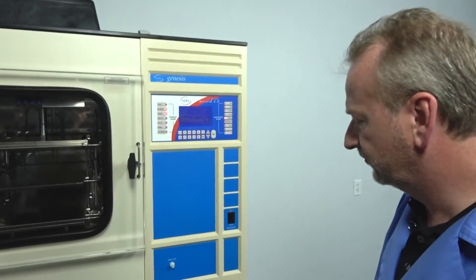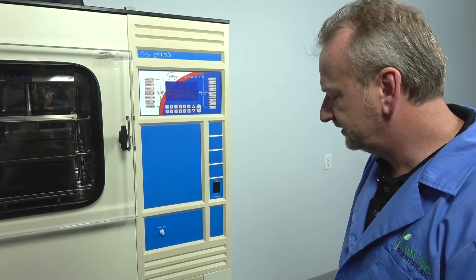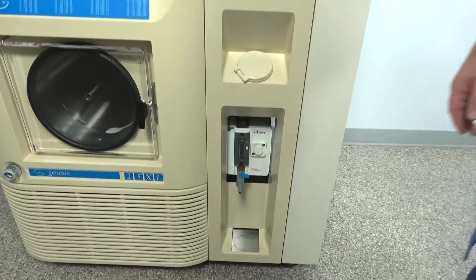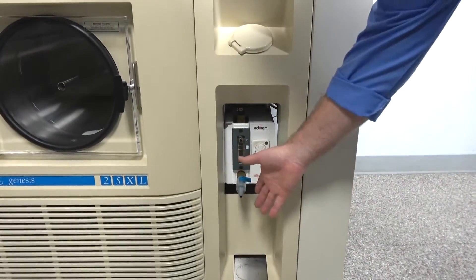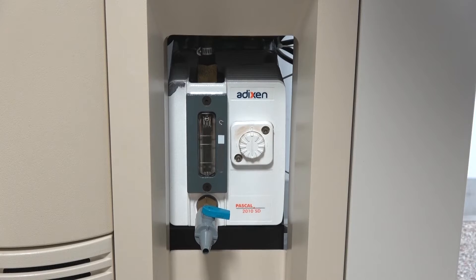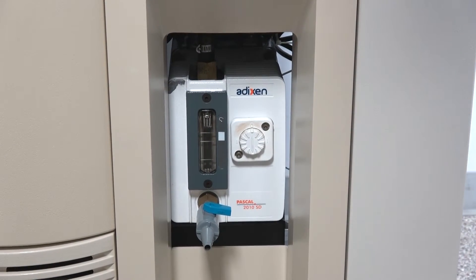Another thing we've included is down here — you can see the vacuum pump. We've included an evacuator that plugs on here so you can quickly change the oil. It makes it really convenient to keep fresh oil in it and make sure you're reaching max capacity with your evacuation.